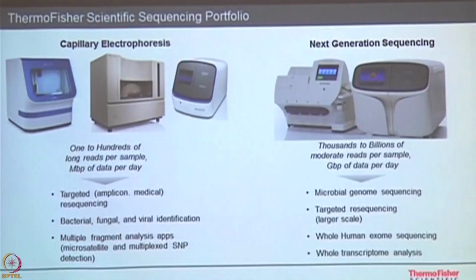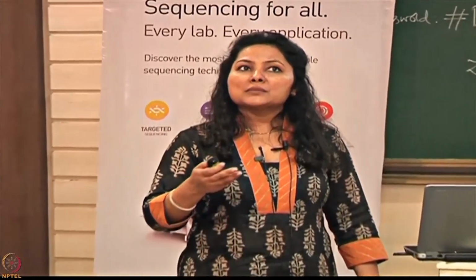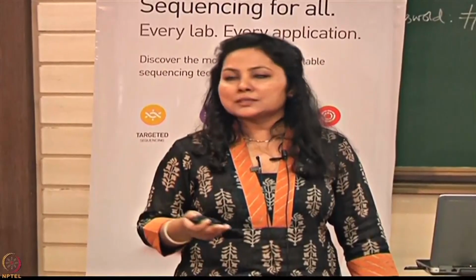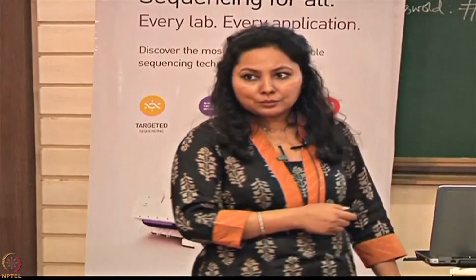Just because we are nowadays talking a lot about NGS, it is not that capillary sequencing has lost its charm or its utility. It is still a very user-friendly technique for a lot of applications. For things wherein you do not really require a lot of data, things can be done simpler. For a lot of microbial research or single gene based tests, they can still be done very well and very efficiently on capillary sequencers.